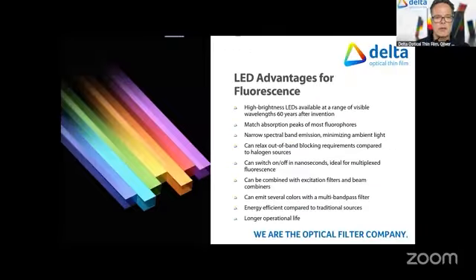So LEDs have become one of the preferred light sources for fluorescence imaging or microscopy because 60 years after their invention, they have now become available at very high brightness and at a large range of wavelengths. So you can reach many different fluorophores with the suited LED. And typically, they're also quite narrow band compared to broadband light sources, which also reduces the noise signal.